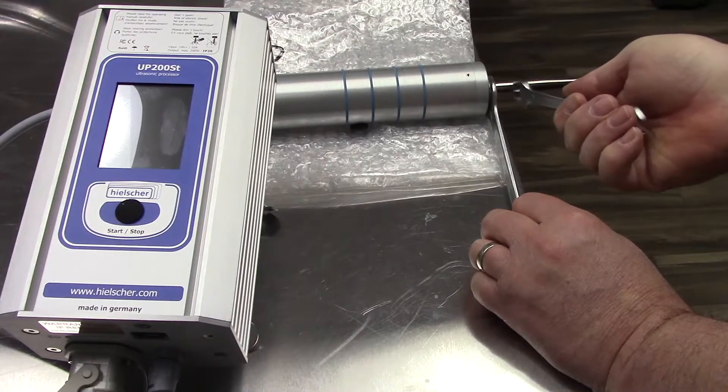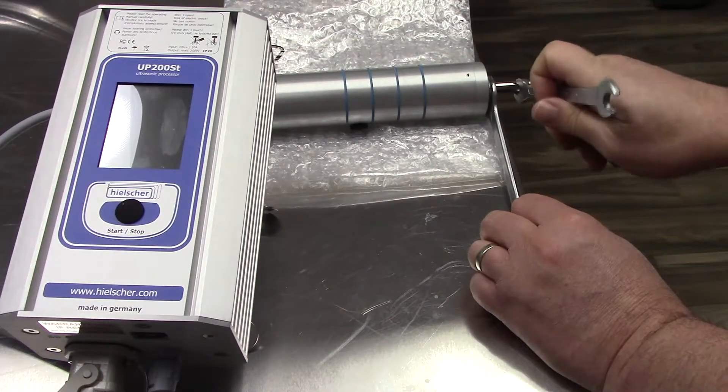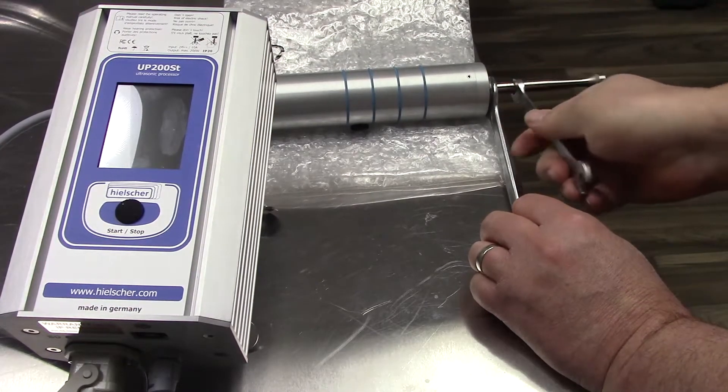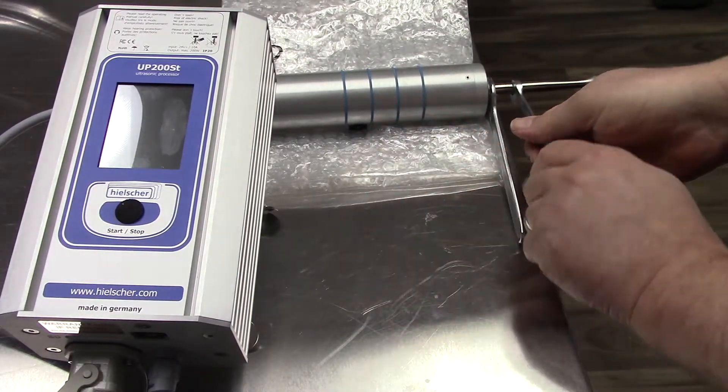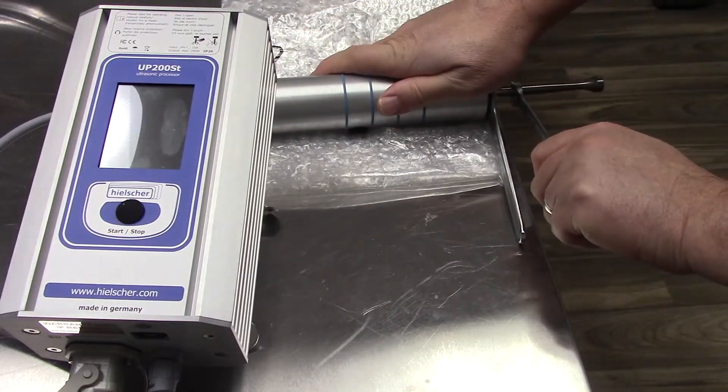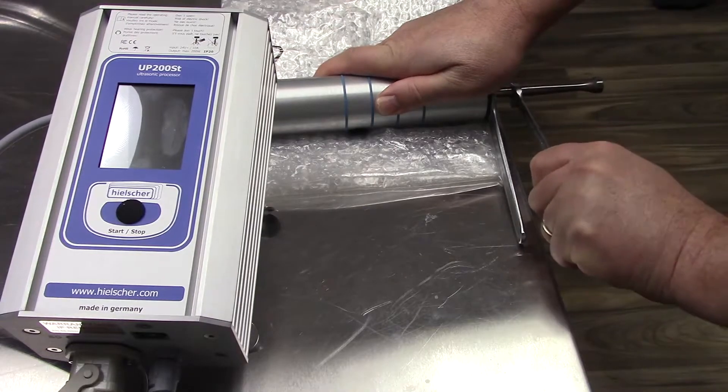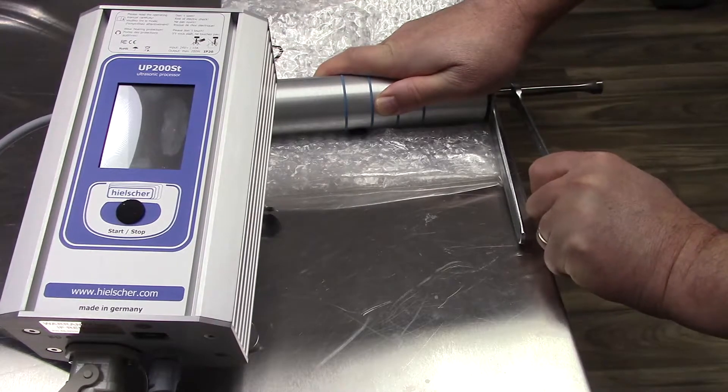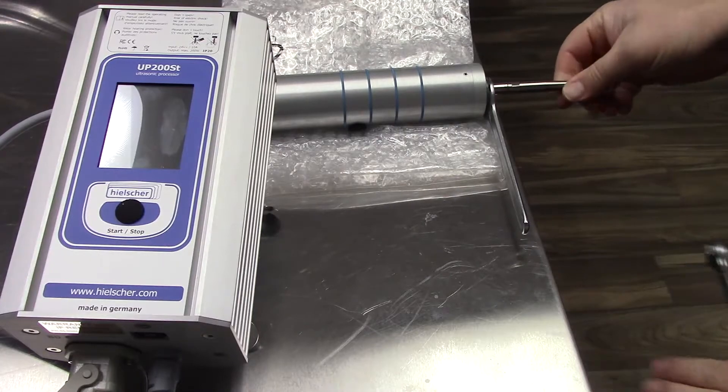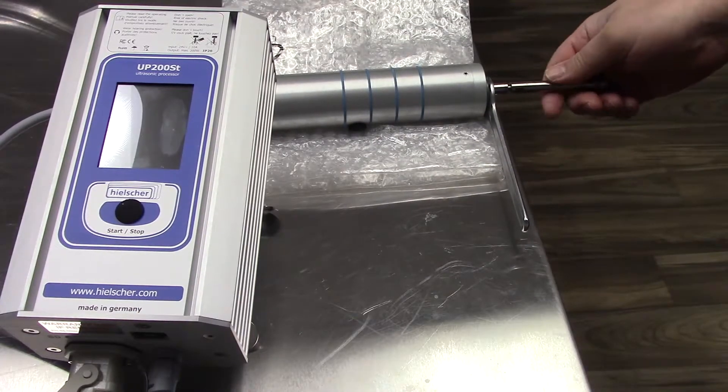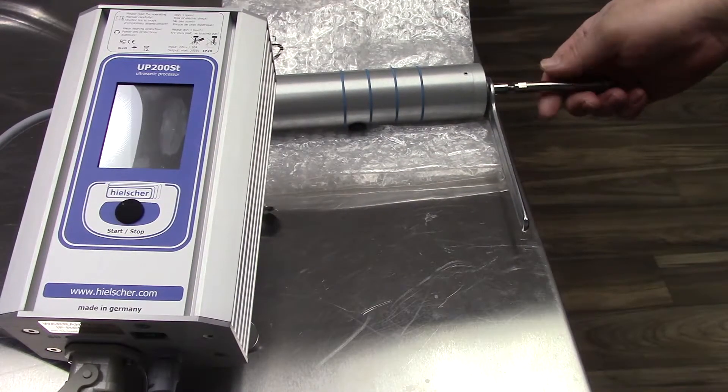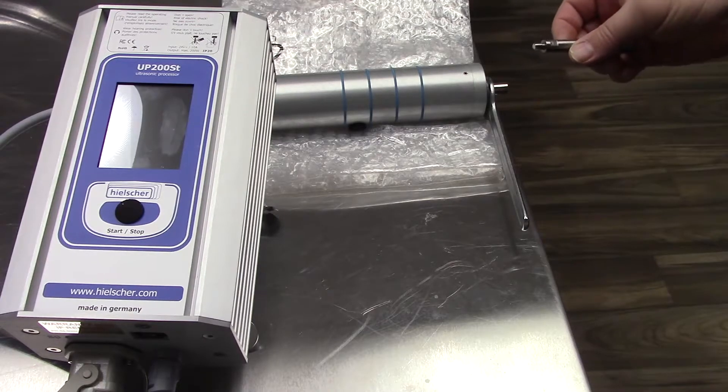Position the second wrench, and holding the instrument, turn counterclockwise, and you should hear a pop. Continue to dismount the sonotrode by turning it counterclockwise.